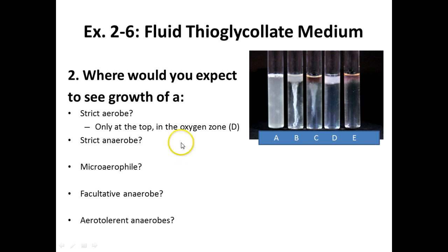This is our strict anaerobe, excuse me. These guys are actually harmed by oxygen and cannot grow in the presence of oxygen. They also aren't utilizing it for their metabolism, obviously, otherwise they'd be dead. We don't have any of these in this class. It's too hard to create a strict anaerobic environment for our organisms, right? So none of you guys are going to have this situation.